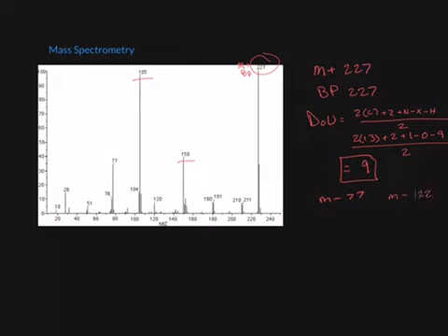Now, it is important to note that an M- of 77 usually means that there is an aromatic present in our molecule, and it is also noted here by this peak at 77. Also, down here we have 76, so it's minus 1, which means we have 1 hydrogen off of the aromatic. And lastly, we have no halogens.